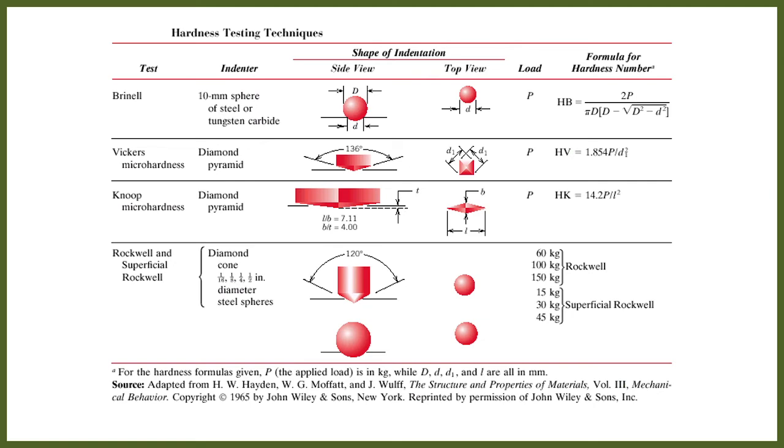For the Brinell test, you use an indenter with the shape of a sphere, a 10 millimeter sphere indenter, and indent the ball into the material.